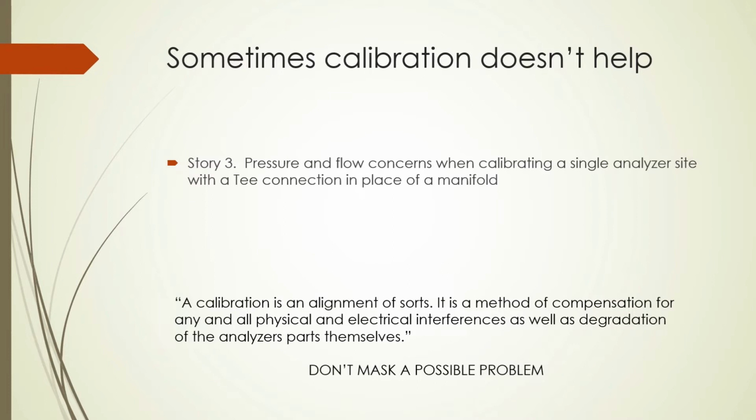It's not uncommon to calibrate a site like this multiple times to get the same result, and you see some spread in results. Not that any is absolutely wrong, but being off by 3 ppb at a 150 set point is not problematic, roughly 2%. But when we hit 15 ppb, we're toeing the line and quite often have to repeat the calibration. So once again, your initial setup and back pressure compensation is key.